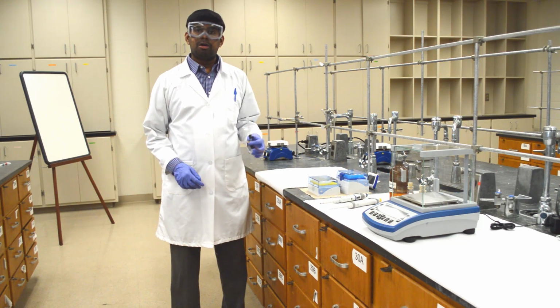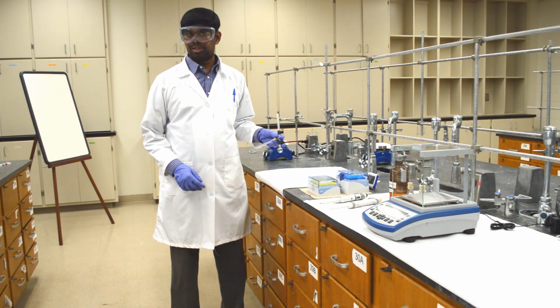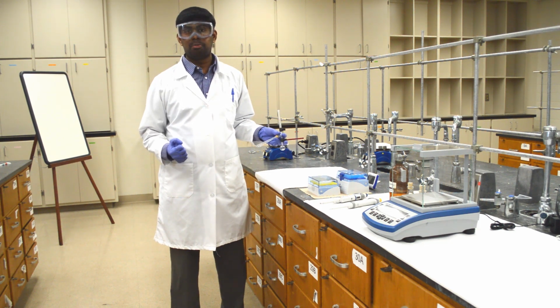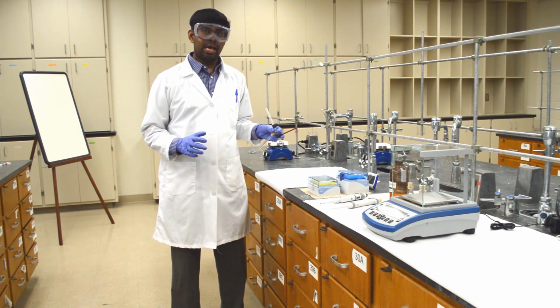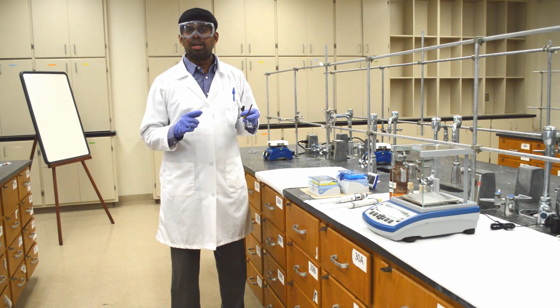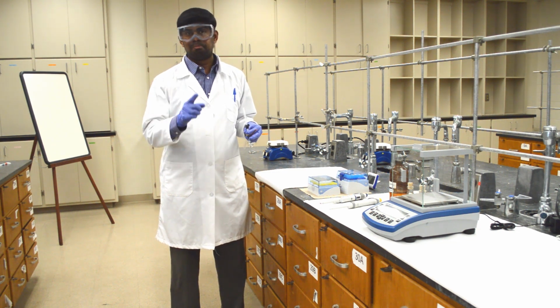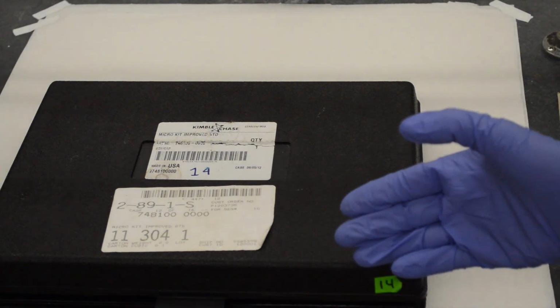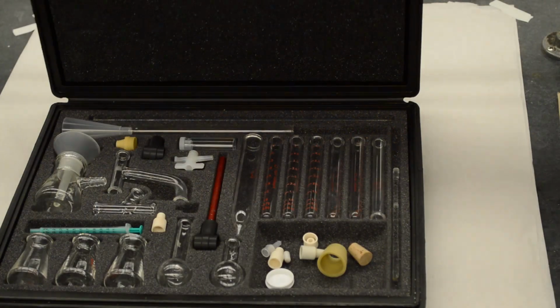In today's lab, we're going to synthesize amyl acetate, which is an ester you can find in the oil of banana. So towards the end of the lab, it's going to smell like an over-ripened banana.